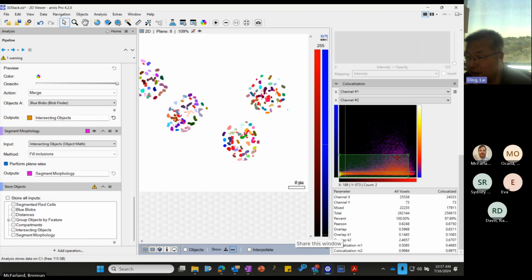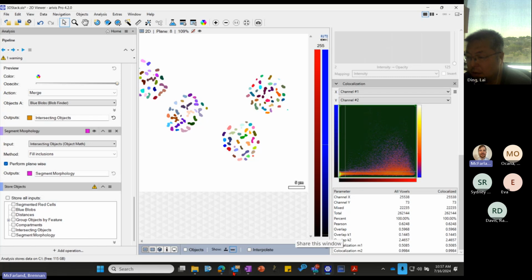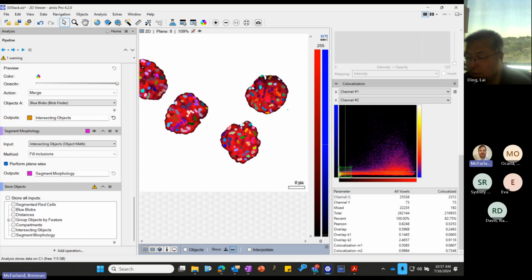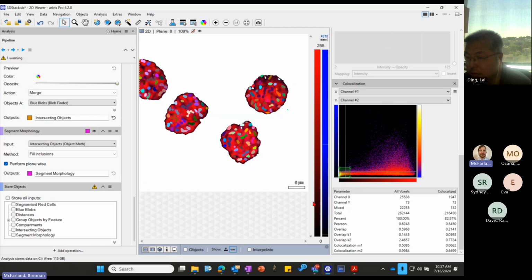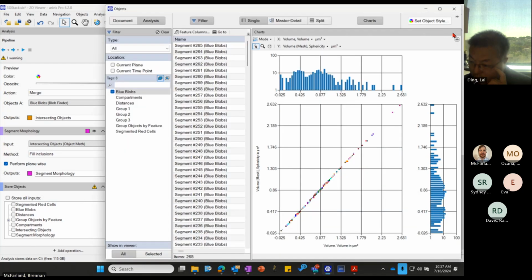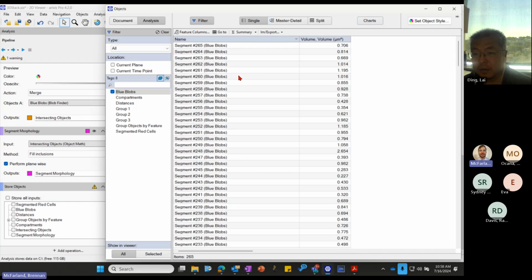That's only for the points inside the green box, right? This is going to be adjusting the histogram, I believe. If I just do this bottom, it's going to take all of these higher intensity regions. This is going to be your lowest intensity regions up here, so you can see it's getting all this background too. Here it's cutting out all that background. Okay, thanks. Right, and all that data information will be contained within this object statement here.